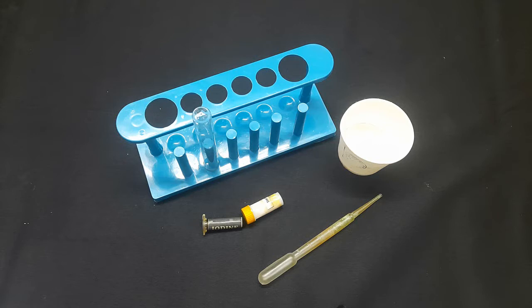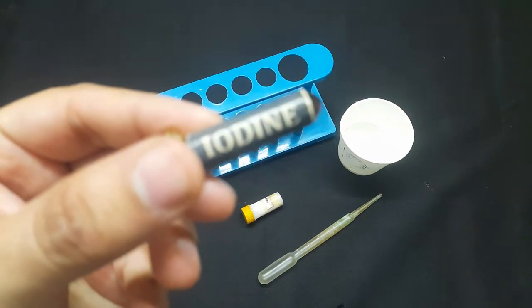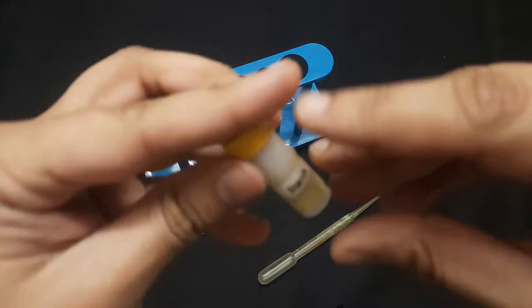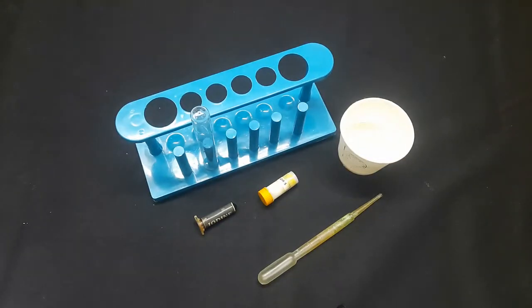Today, we are going to do an activity to test for the presence of starch in a food. In this activity, we need a test tube stand, test tube, iodine solution, which is already there in your kit, starch powder, one dropper and a cup of water. So all this material we require in this activity.